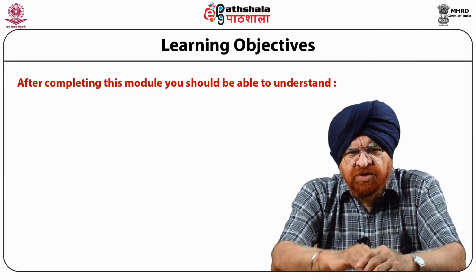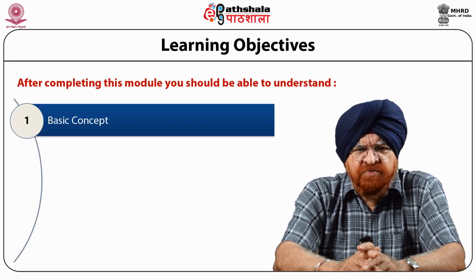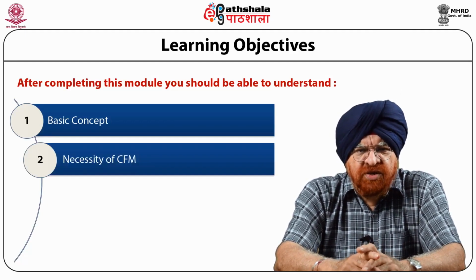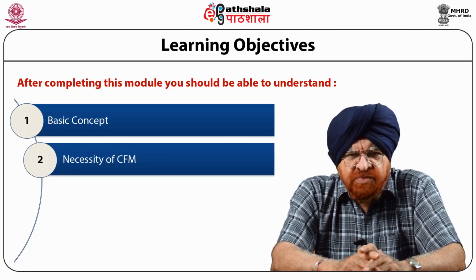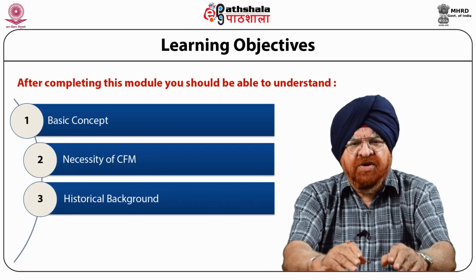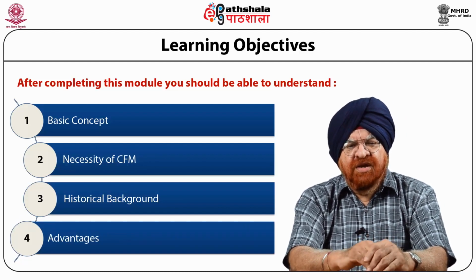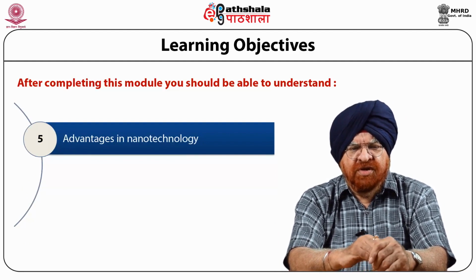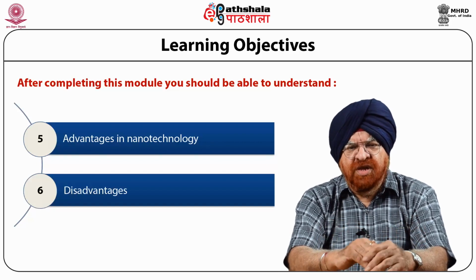After going through this module, you should be able to understand the basic concept of CFM, the necessity of CFM, that is why this was required, and what is the historical background of this. You will be able to understand the advantages of this, the prime uses of this in nanotechnology, and finally the limitations or disadvantages, as we call these.